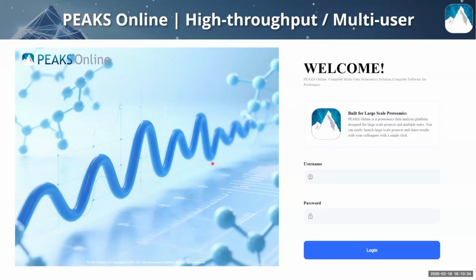So let's start specifically about Peaks Online and the advantages of a server-based platform. So this is kind of an example of the web browser. When you first go to log into Peaks Online, this is what you'll be displayed. And everything is actually deployed on the user's end for full confidentiality. And Peaks Online is really designed to take advantage of powerful and shared computing resources to perform these peptide and protein identifications.